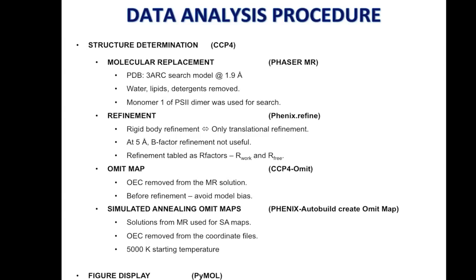Then coming to the actual electron density. Once you have the phase information, you can plot the electron density as was shown in the previous talk. But there are various other ways of making sure that the model we use does not impose a huge bias on the information we get when we just put in the diffracted intensities and get out the electron densities.